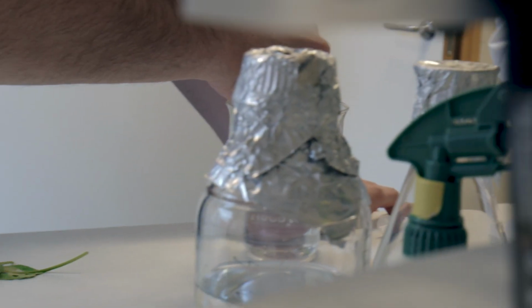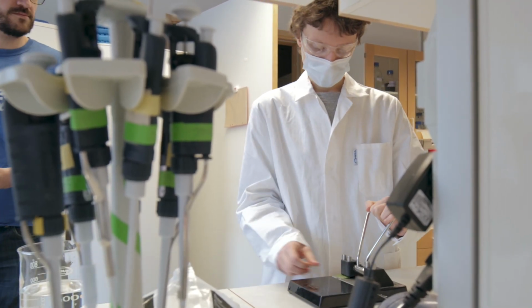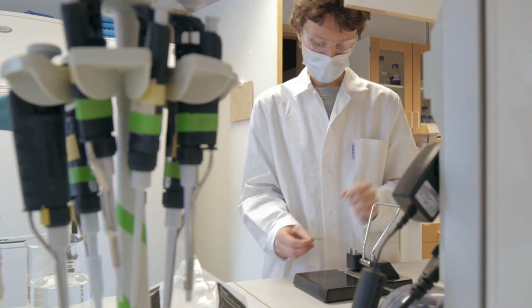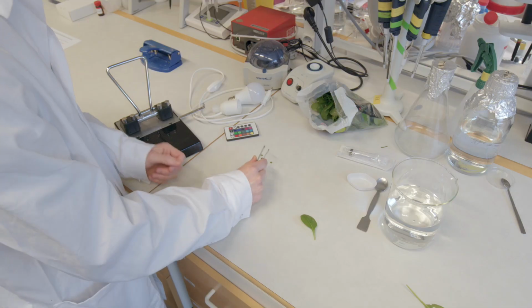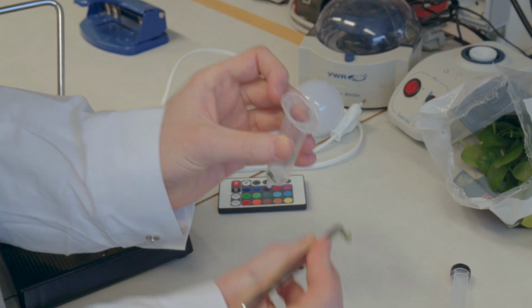To make things simple and fair, we are not going to use whole leaves. Instead, we are going to cut out small discs of the same size. When we do this, we must be gentle and try to use the green bits of leaves without veins. Let's cut out 10 discs.